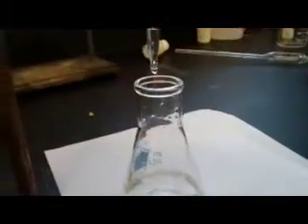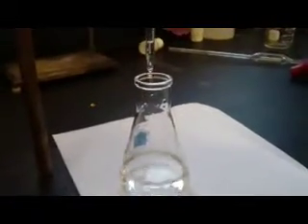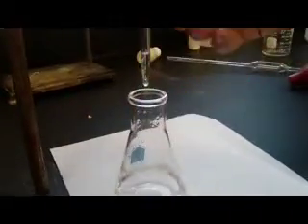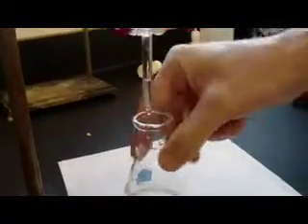All right, so I'm getting really close here. Just adding a drop or two at a time. So you guys, what you're looking for is it to just turn pink and stay pink with the addition of one drop. The best way to get one drop is to do that quick little twist. Mr. Sands is pretty good, so he can adjust the stopcock. That's the valve.